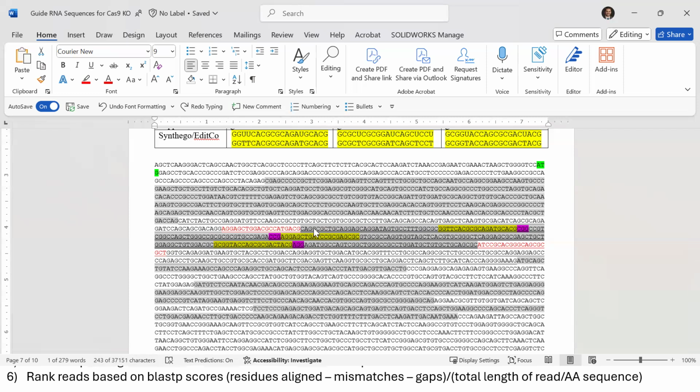All right. And what our job is to determine if those 81 amino acids match the wild type sequence or if they vary significantly within the space of these target sites here. Okay. So some of them are going to be shorter, some of them are going to have mutations, etc. Okay. So without any further ado, let's jump right into how we're going to analyze that in Galaxy.